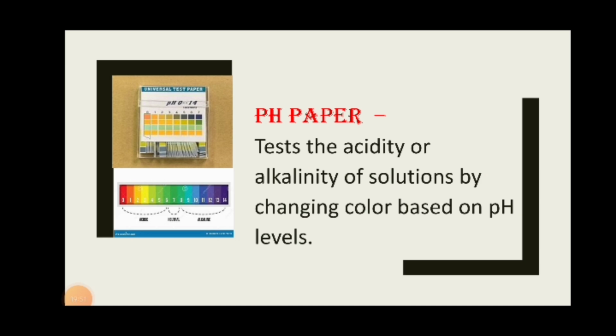So actually in the 7 color, that is the neutral, then above 7 that is alkaline, basic, and then below 7 that is acidic, from green going to the yellow, and red that is acidic, less than 7, and green going to blue, violet, indigo, etc. That's a basic pH range with that one.